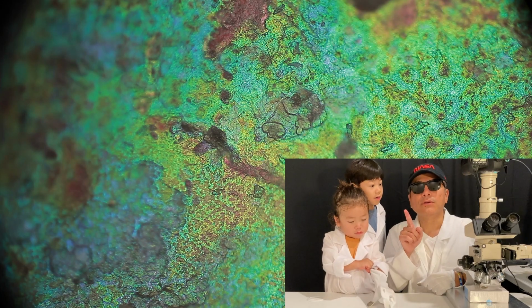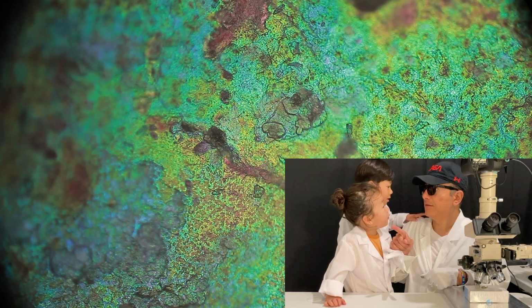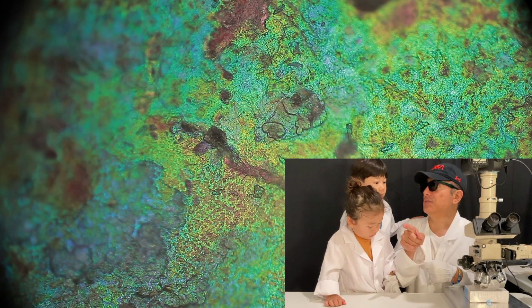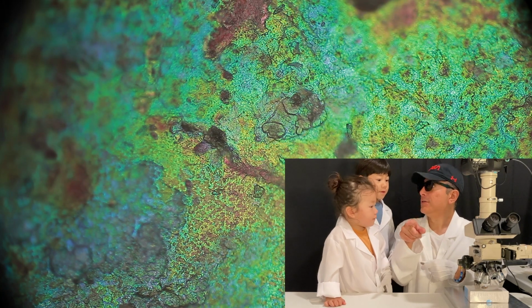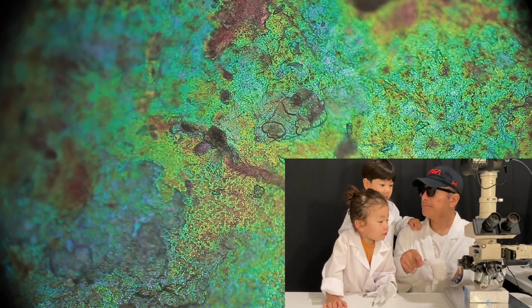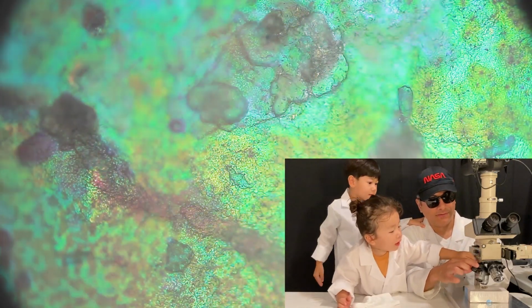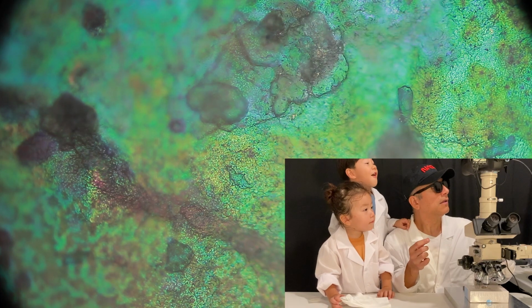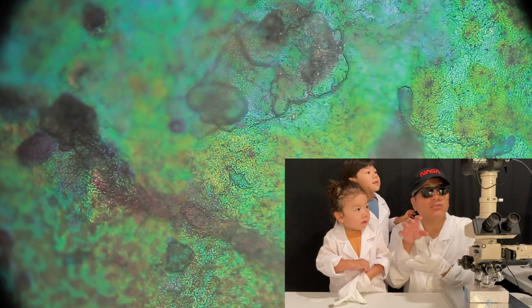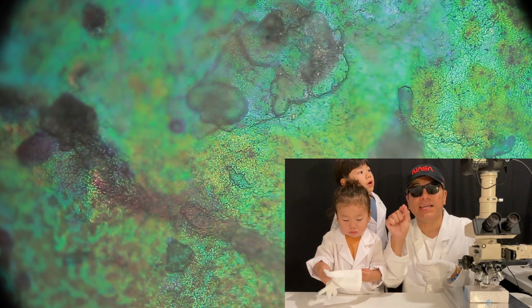We need one more objective to explore. We need to go to the 50x objective. Should we go deeper? Yeah, we have one more. Do you want to spin it for me? Okay, spin it the other way. Oh, there it is. There's 50x. I see green and pink. And now we're so zoomed into his shell that we can see fine little grooves and indentations in it.